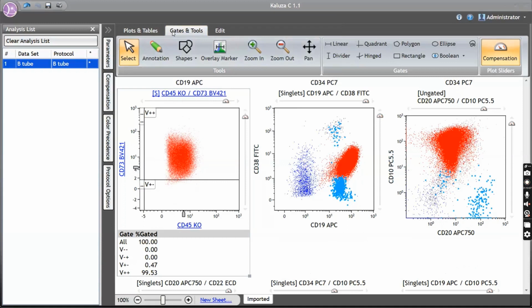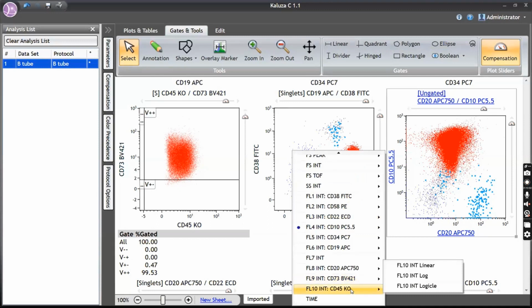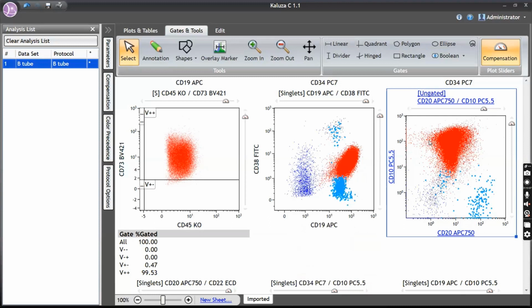Why do we need a separate tube for TdT and cyto-MPO? Because both are cytoplasmic markers. If you have attended the basics class, basically I would not allocate a tandem dye to a cytoplasmic marker. And in our panel, the non-tandem dyes are very few in number. FITC is a non-tandem dye, PE is a non-tandem, KO is a non-tandem dye. So that is the reason why I will not put a lot of cytoplasmic markers in one tube. Maximum I can use up to 3 cytoplasmic markers in one tube. That is the reason.